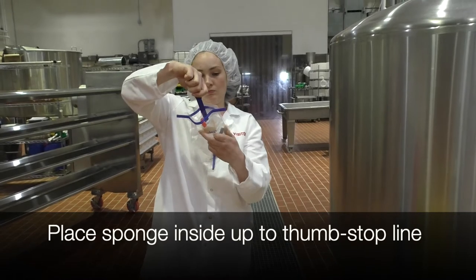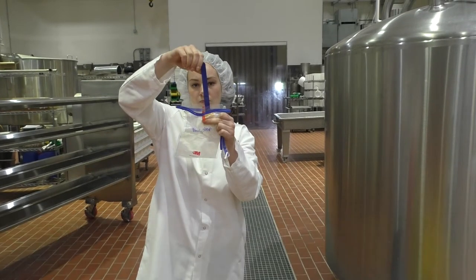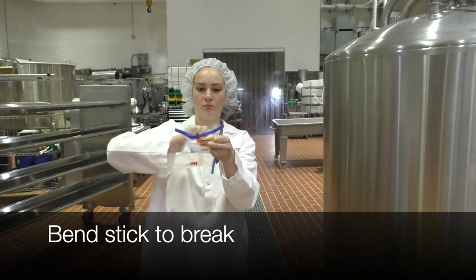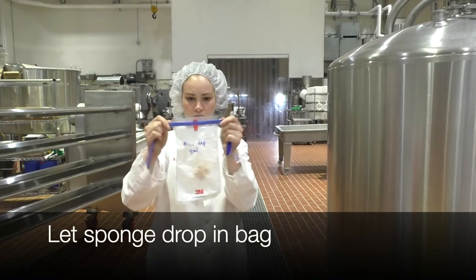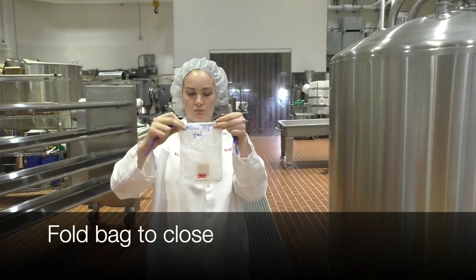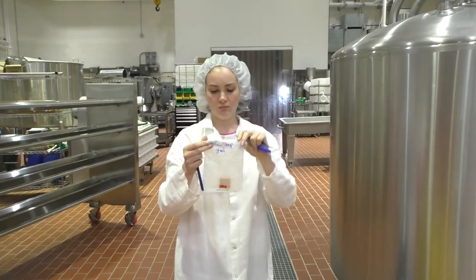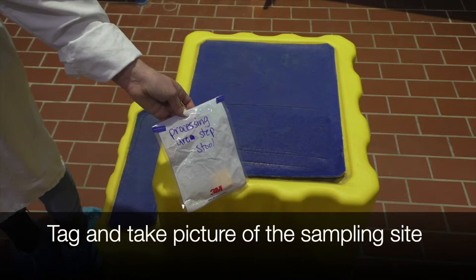Aseptically place the sponge into the bag up to the thumb stop and hold the sponge in place inside the bag. Don't put the stick inside the bag. Bend the stick in a back and forth motion to break it off from the sponge. Allow the sponge to drop in the bag and discard the stick. Fold the bag to close, remembering to not touch the opening or inside of the sample bag. Fold the ends of the blue wires inward. Label and take a picture of the sampling site.